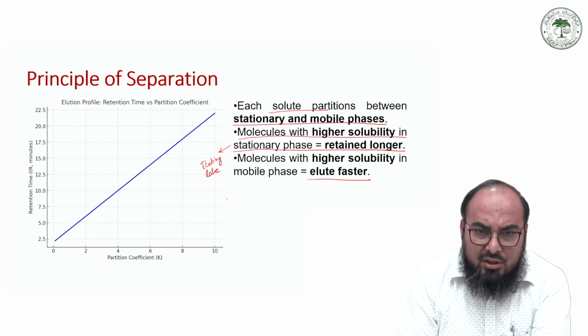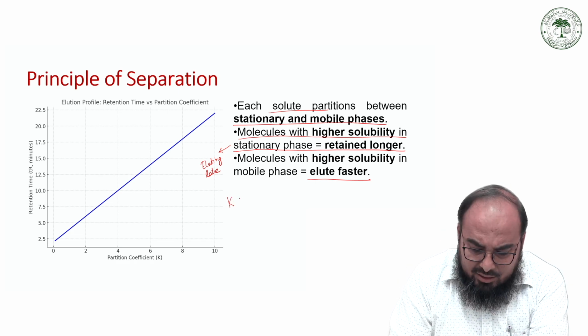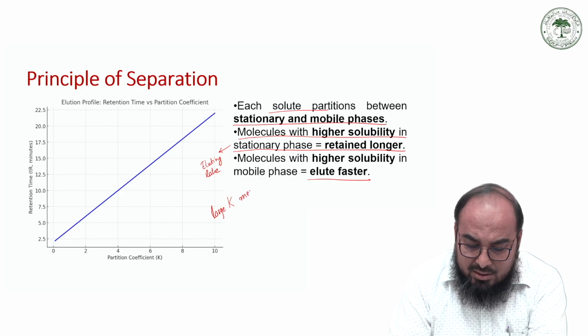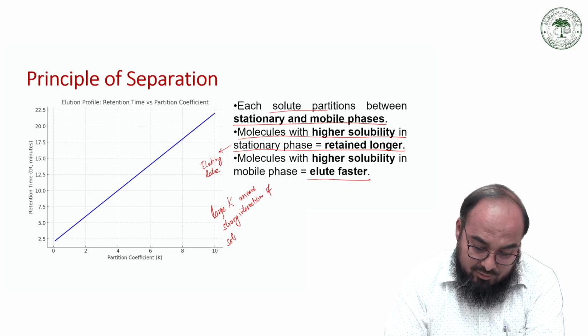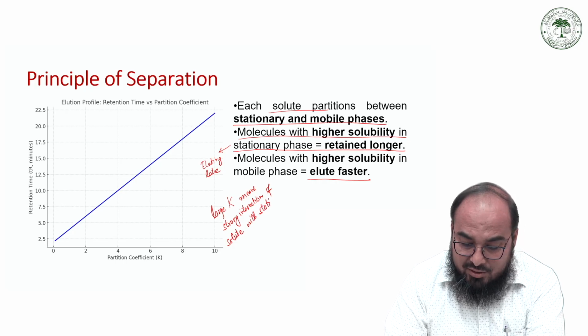Now, if you think in terms of the partition coefficient, a large K means strong interaction of the solute with the stationary phase.